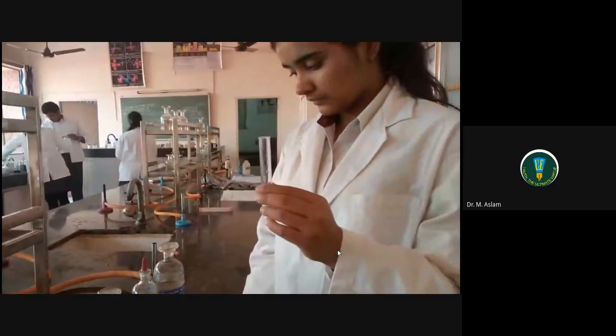Addition of ferrous sulfate, the two solutions are miscible. Now the solution has OS plus ferrous sulfate. Now is the catch. The final step of the brown ring test involves addition of sulfuric acid slowly, carefully, cautiously from the sides of the test tube to observe a brown ring. The brown ring would be towards the middle of this solution only if the amount of concentrated sulfuric acid is higher. So see to it that at least 1 ml of concentrated sulfuric acid is added to the sides of the test tube. That's how it's to be done.